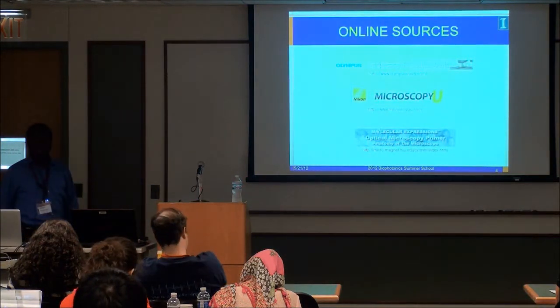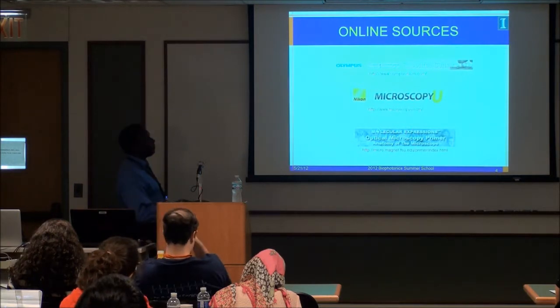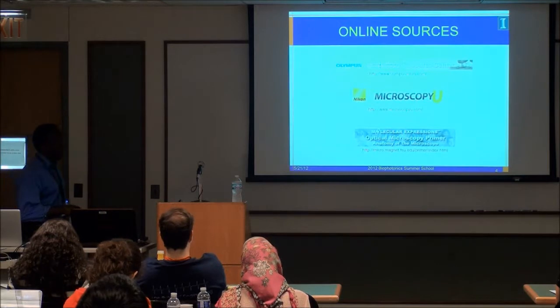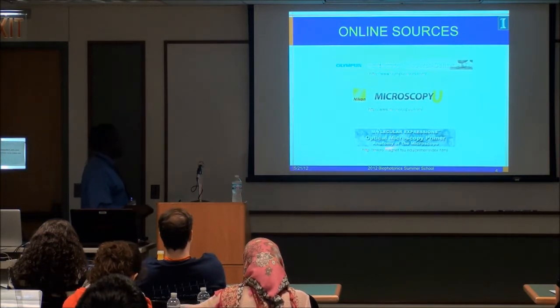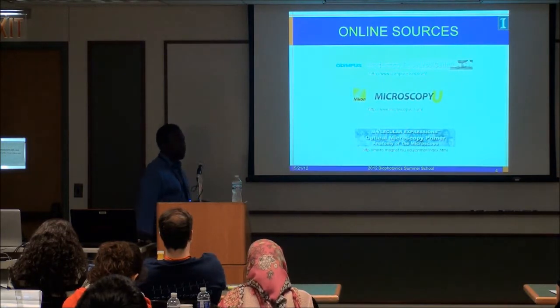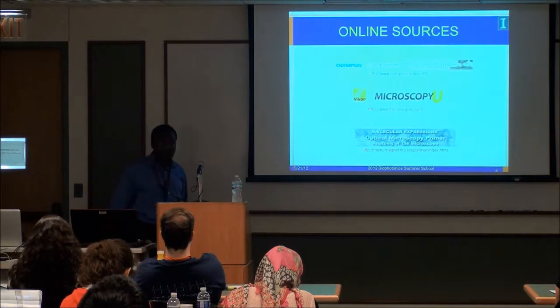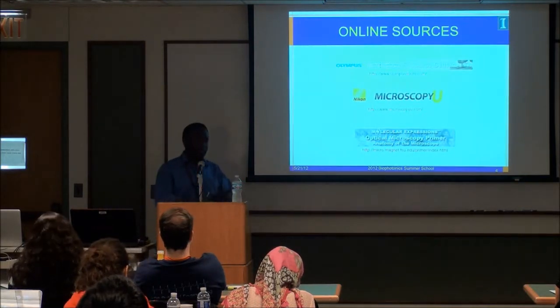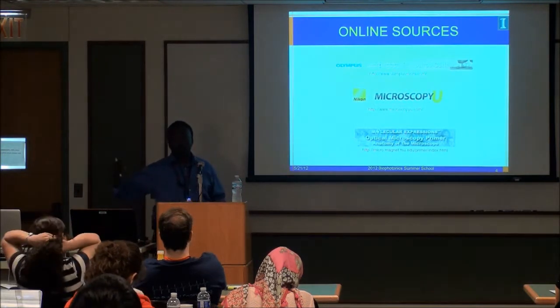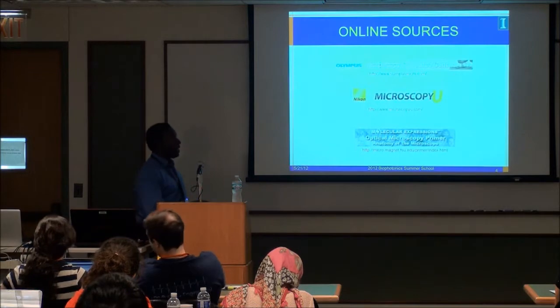For those of you who may not know this, I think when I started, this was just coming around when I was a postdoc. Olympus, Nikon, and something else, just calling generically, it's based at FSU, Molecular Expressions. They have some very nice Java-enabled tutorials on microscopy and the peripheral areas surrounding microscopy. So if you want to learn a little bit more about detectors or laser sources or what have you, all of that is in these websites.